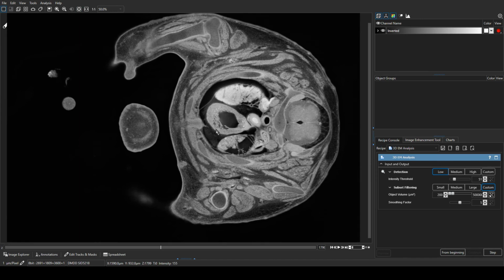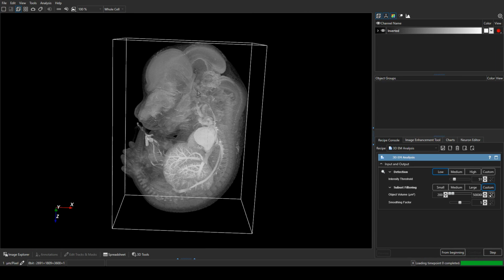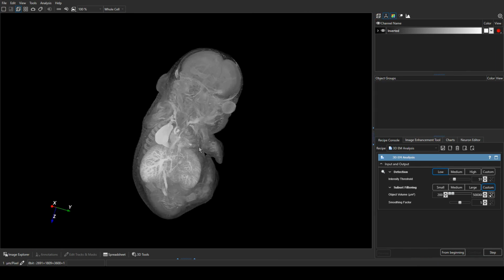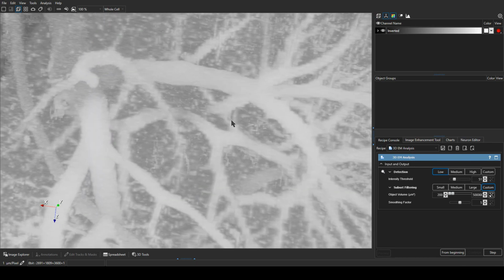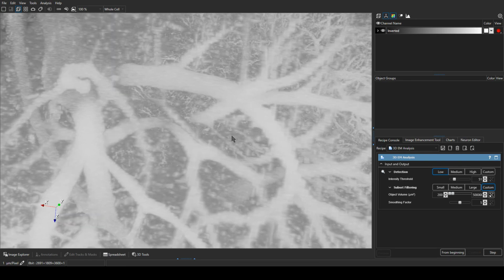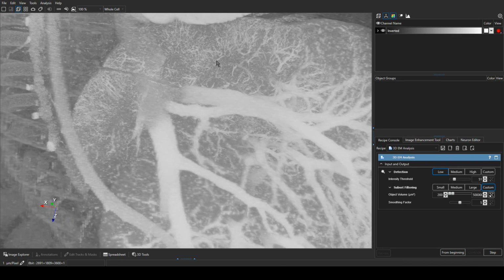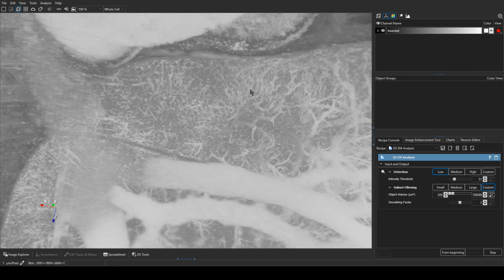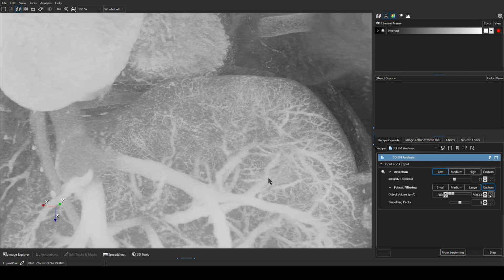So that's 40 gigabytes, and it's there. That's less than 3 seconds, and we can start to interact with the data set. And if you zoom in very quickly, you might get a chance to see that you don't have the full res yet. And if you wait a little bit, you start to get all the details. You can see there in the background those very fine structures, and actually the whole view is updating to show the finest structures that this data set can offer.